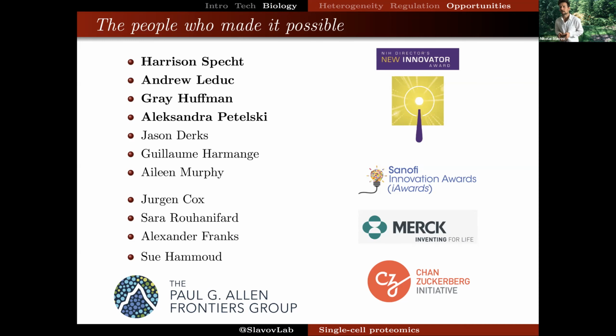That means the protein needs to have at least 1,000 to 10,000 copies to be analyzed reliably. Most of the losses occur because ionization is a relatively inefficient process. But there have been published prototypes increasing the efficiency from 1% to 50% or so.